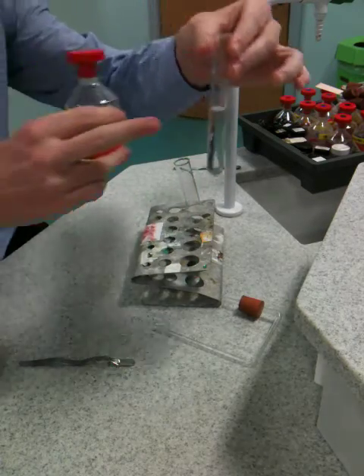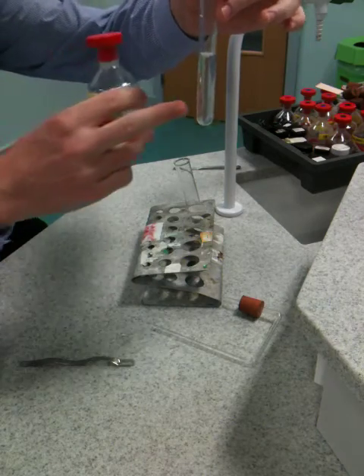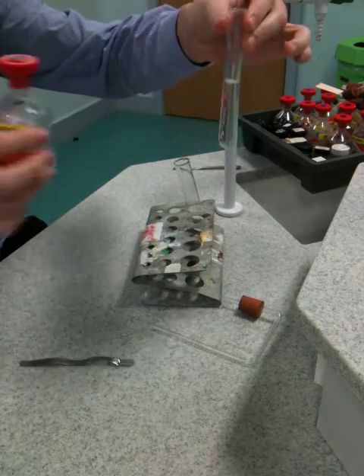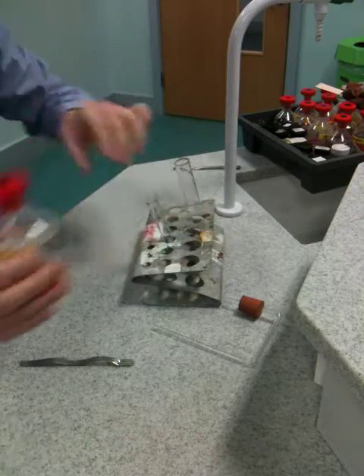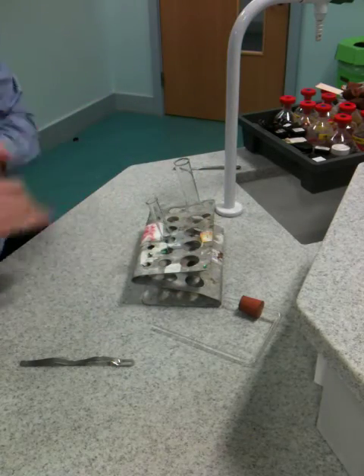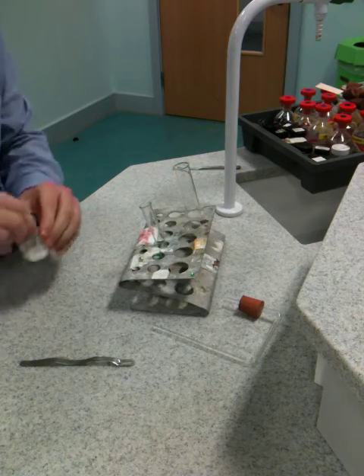Then the lime water will be poured into our tiny test tube — here's one I've prepared earlier. You want to about half-fill the test tube with the lime water, and you'll see why. Note: put the stopper back into the lime water.